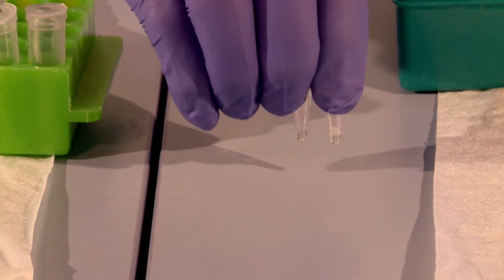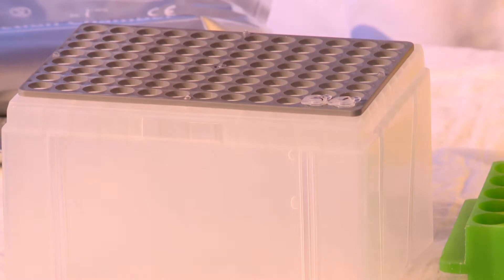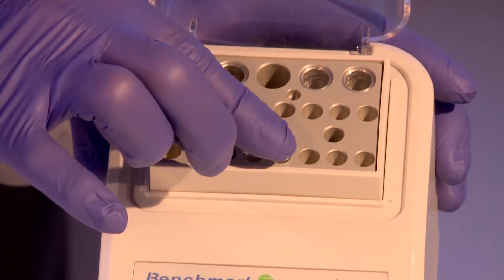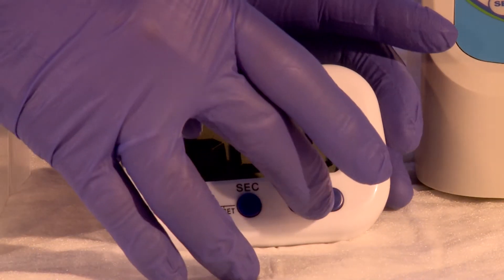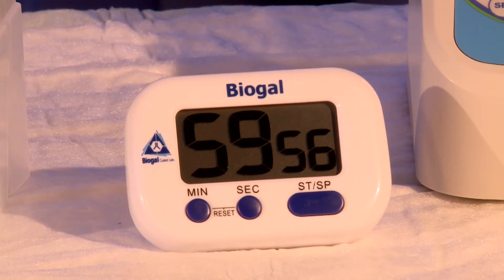Tap the tube on a surface to bring all the fluid to the bottom of the tube and incubate the mixture at room temperature for one minute. Place the reaction tube into the appropriate hole in the preheated block and incubate for one hour. Do not open the tube cover at any time during or at the end of the incubation period.